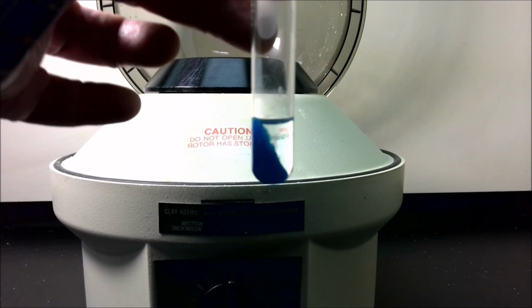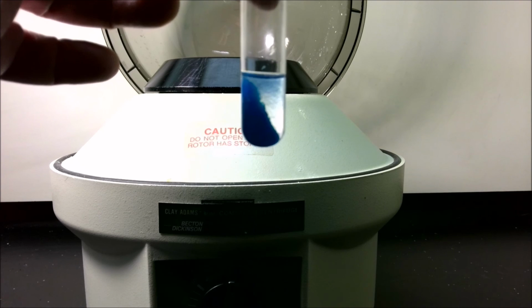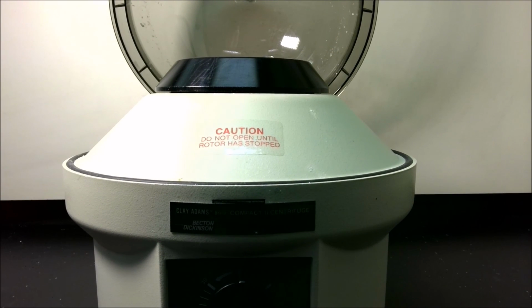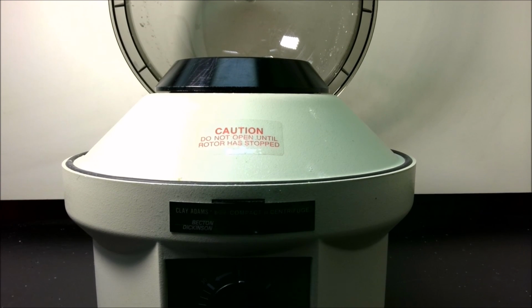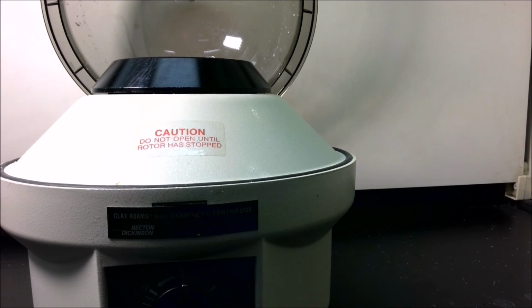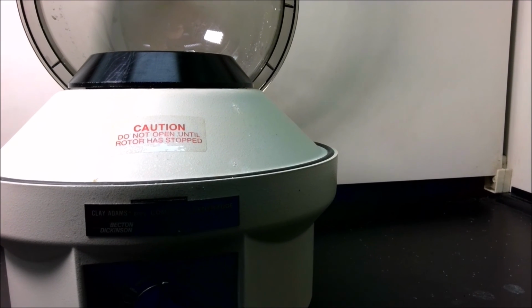Make sure there's no more copper in that solution, so we add a little bit more sodium hydroxide. When we do so, we see a few more pieces of solid. So we're going to have to mix it up, add a little bit more sodium hydroxide, and centrifuge it again. This process continues until, after centrifuging, we test the liquid and no more solid is formed.